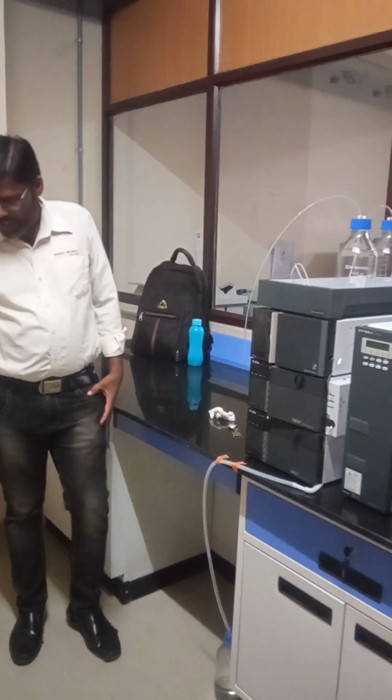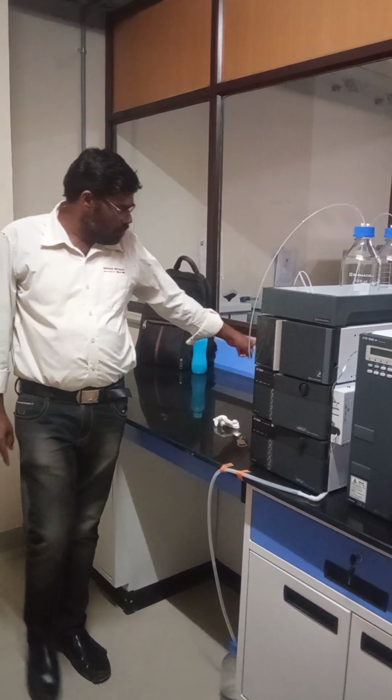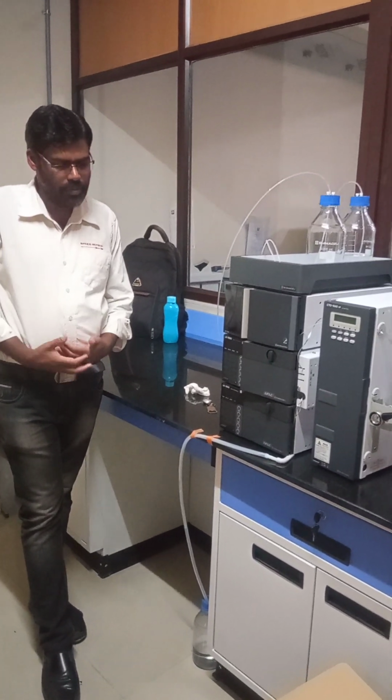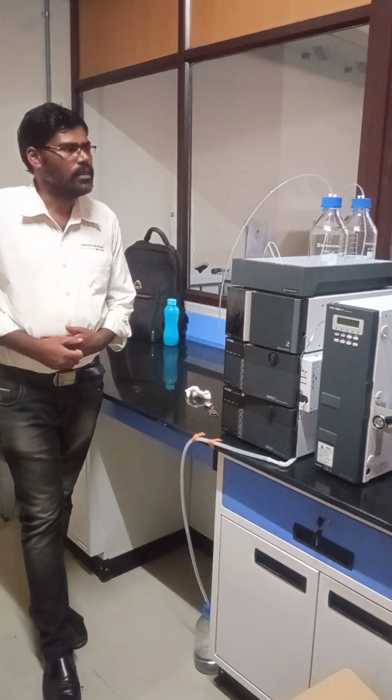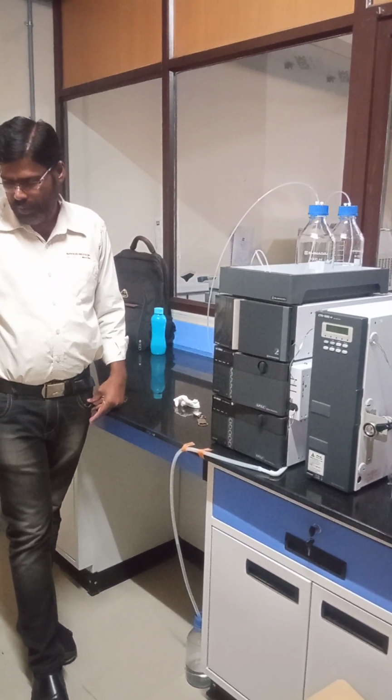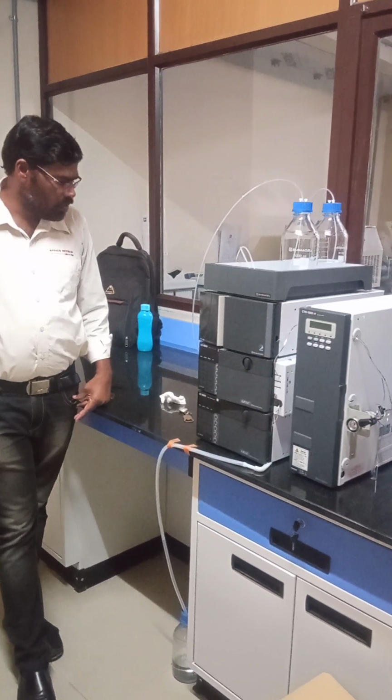HPLC operation procedure. Power on the backside button. This is the SOP; even if I am not there, you can continue based on it. Okay, power on the backside power button.